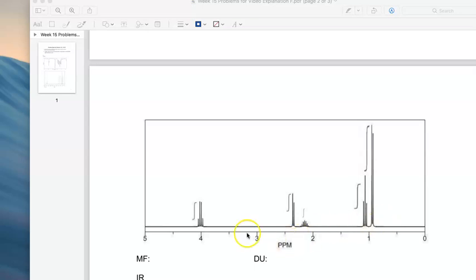So looking at the first signal here from left to right, we have 4 distinct peaks, so 1, 2, 3, 4, within the signal at 4 parts per million. These peaks refer to how many neighbors the hydrogen has, or tell us how many hydrogens are attached to the next carbon on either side of the carbon represented by the particular signal. The formula we use is n+1, where n stands for the neighbors, to figure out how many peaks will be shown.